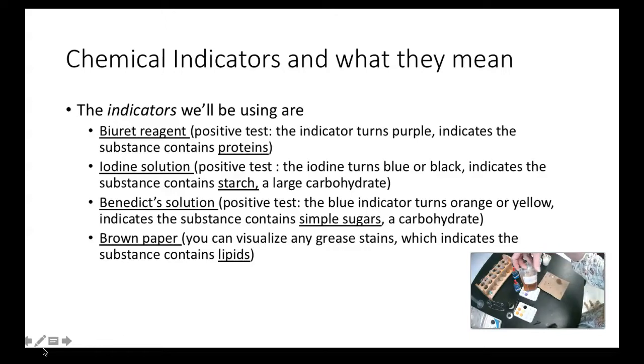We also test apple juice, vegetable oil, and we test plain water to see if there are any macromolecules in that. All right, so there are our variables and our parameters, and now I'm going to blow up the picture.